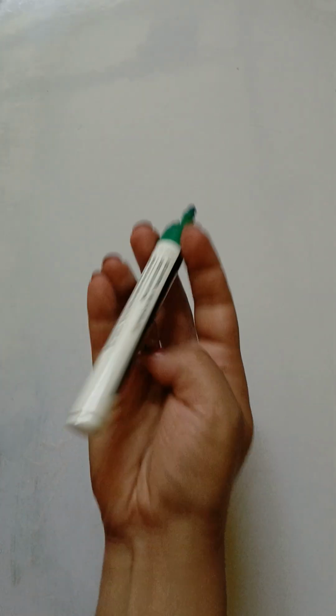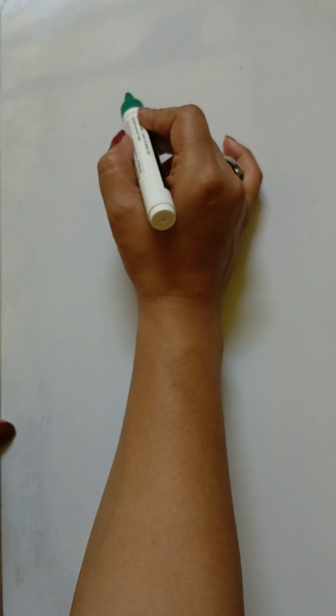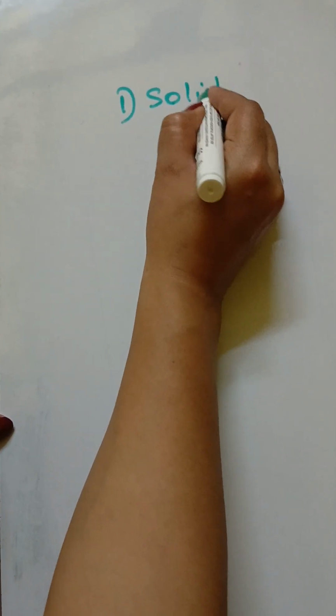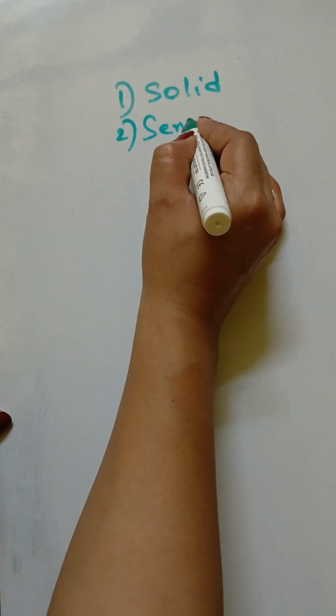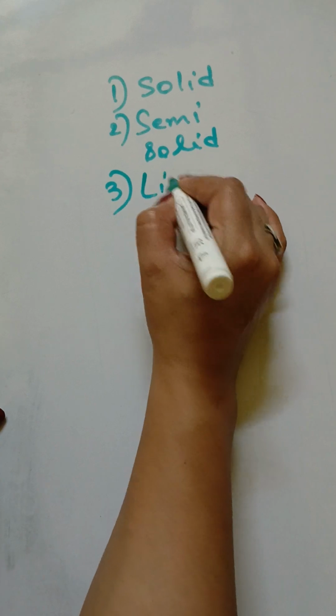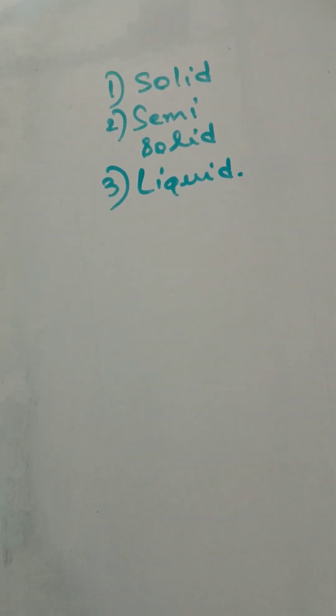In this video, we will learn about agar, which is basically an excellent hardening agent of the media. Depending upon the physical nature of the media, it can be subdivided into three types. One is solid media, one is semi-solid media, and another one is liquid media. So there are three types of media based on the physical nature of a media.